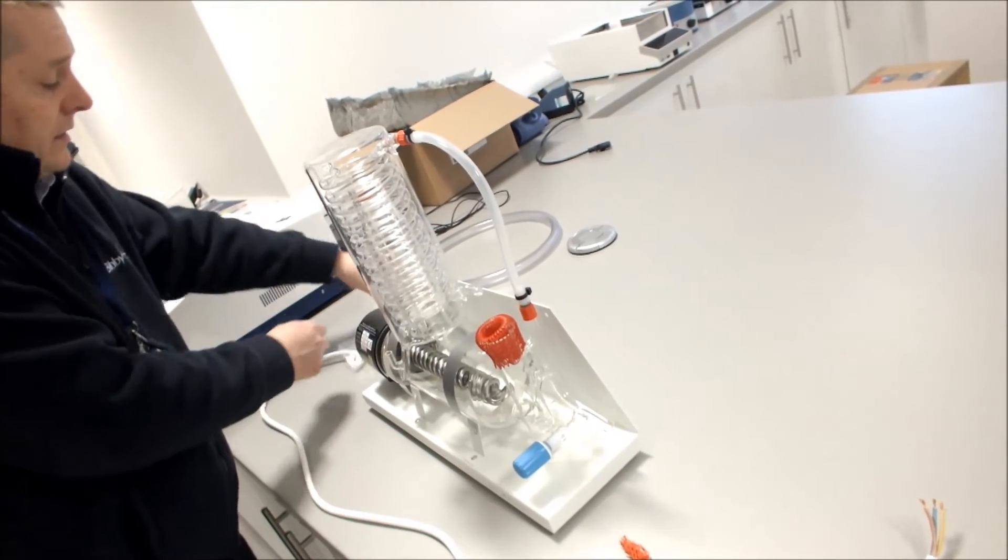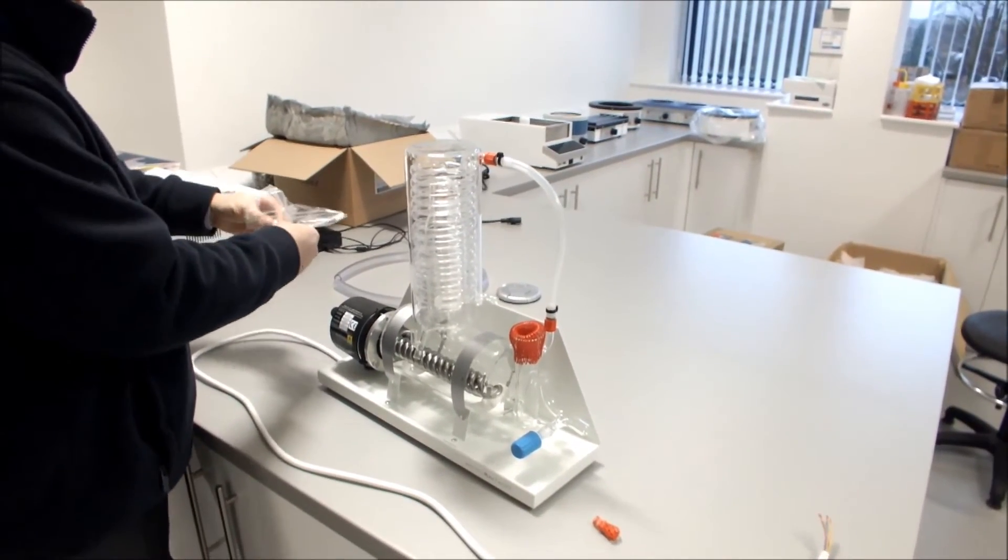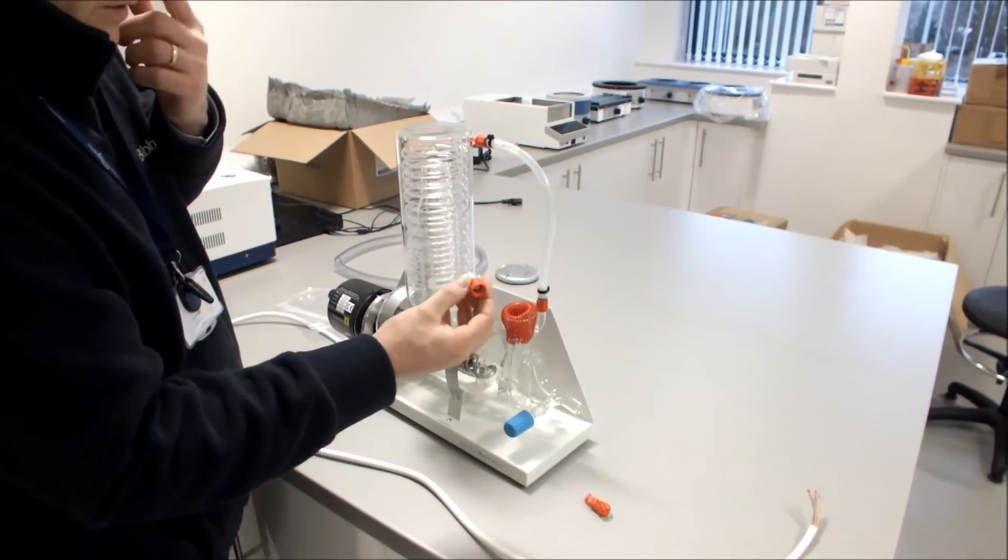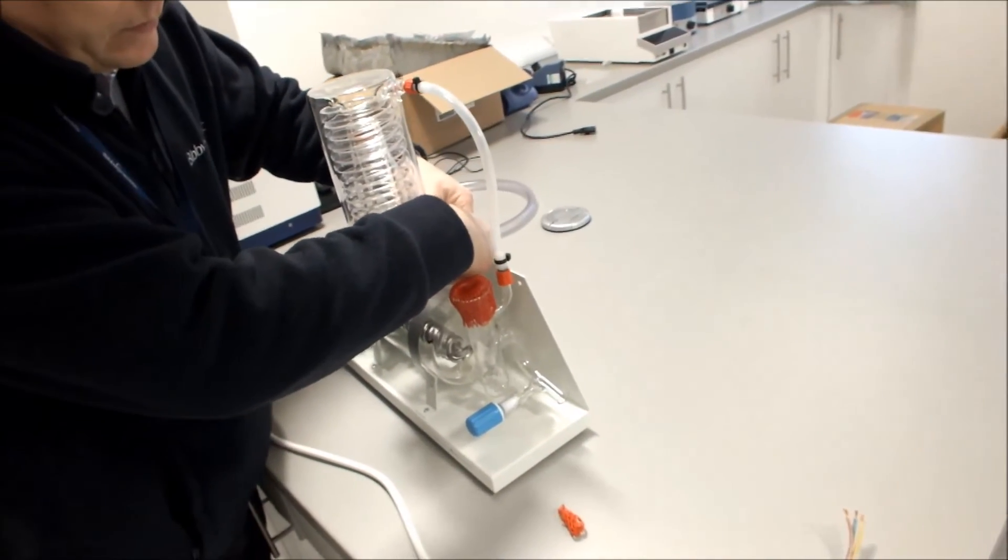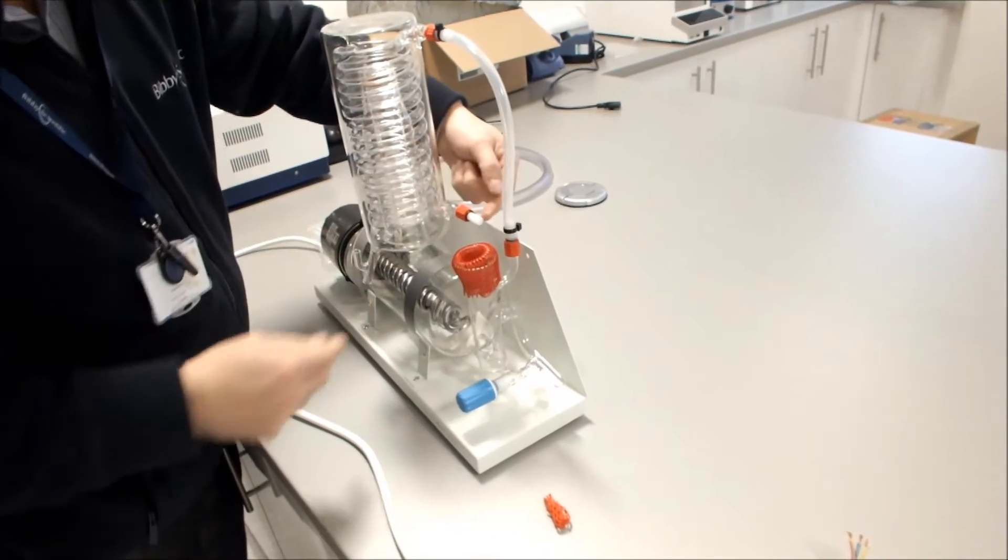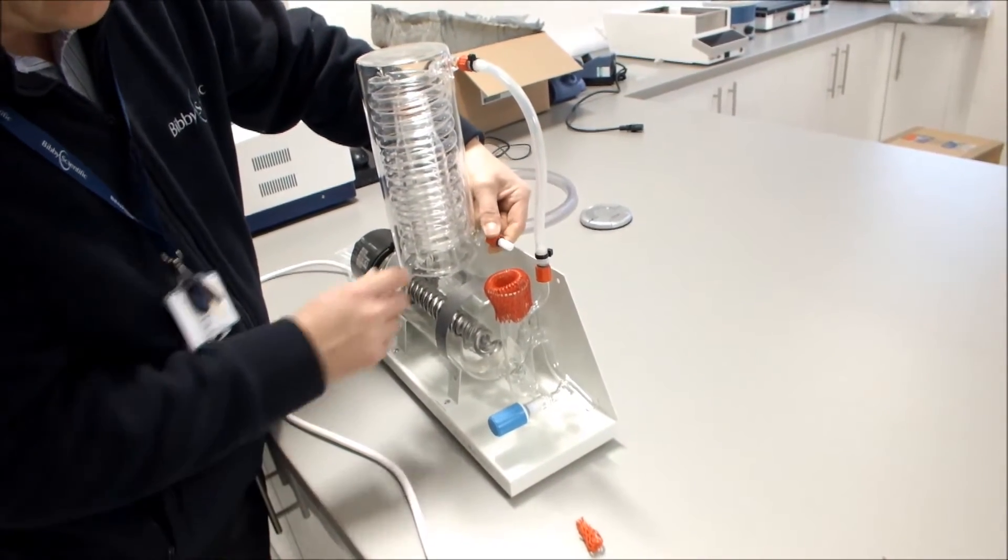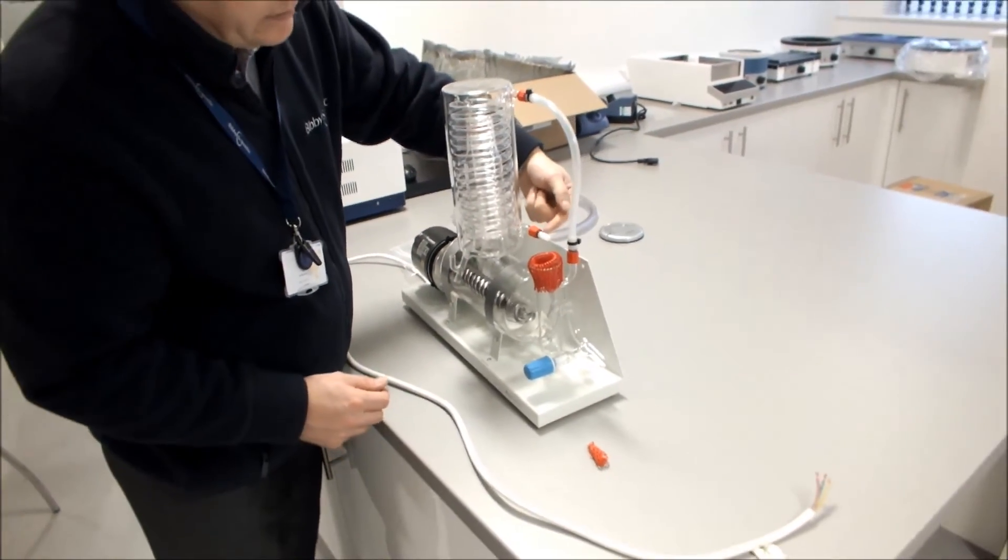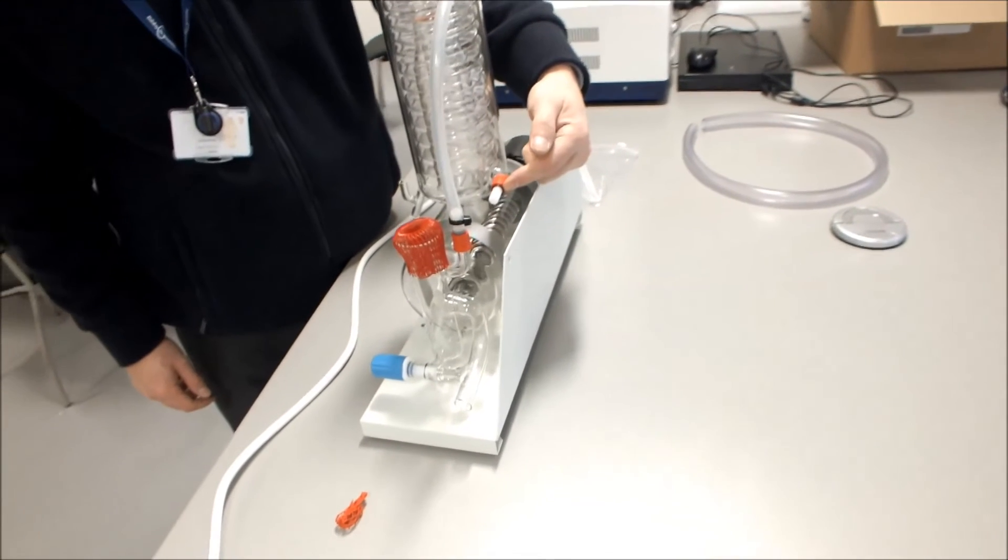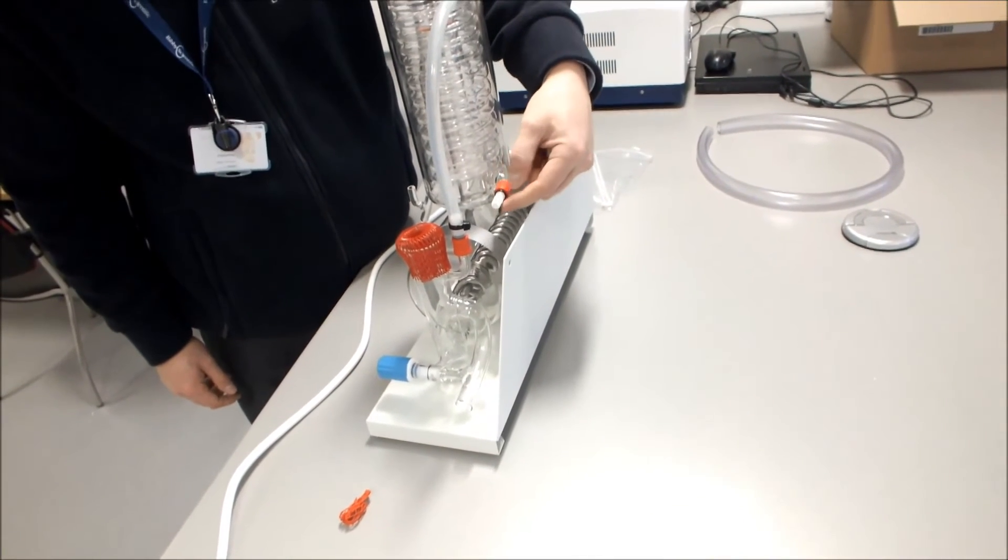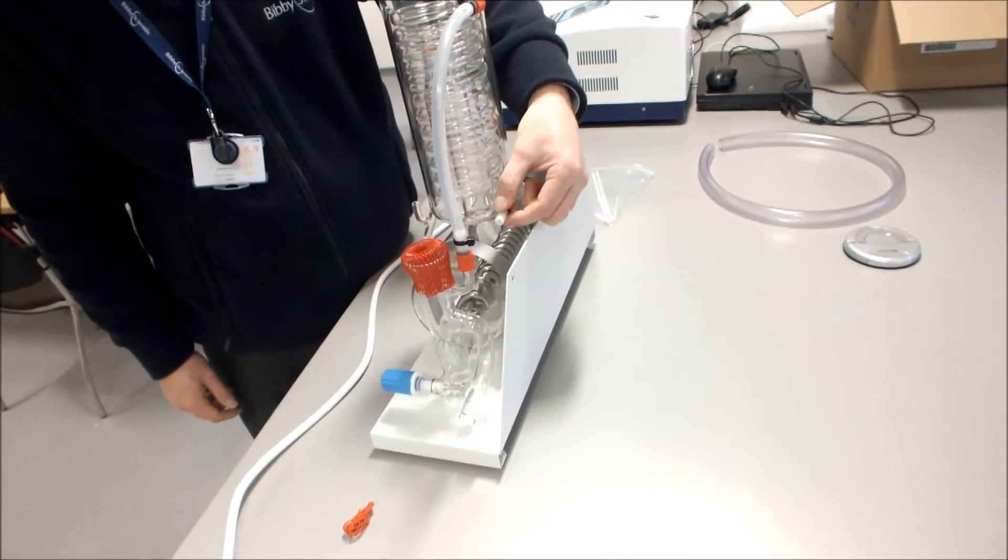We can then take the spare connector from our hose kit and connect that to a cold water inlet connector to the condenser, which is on the lower. This, then, is the connection you will make to your cold water supply. Use quality tubing and make sure you use hose clips, tie wraps, etc. when connecting it on.